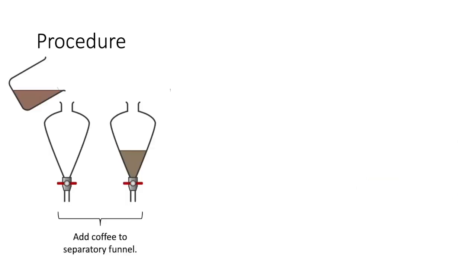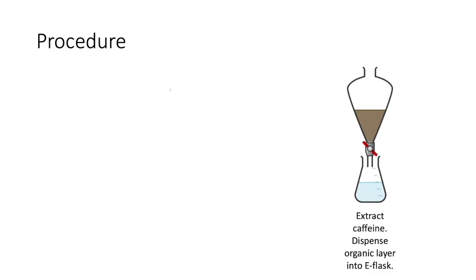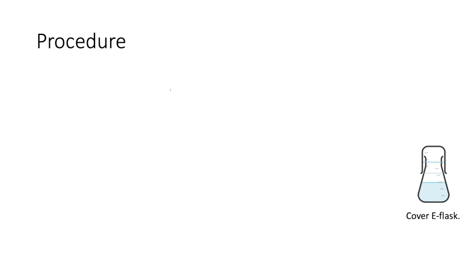At this point, you should transfer your coffee solution into a 250 milliliter separatory funnel. And then, at a fume hood, add a 15 milliliter portion of chloroform into the separatory funnel. Then you should extract the caffeine into the chloroform layer using either the instructions given in the lab manual or in the video related to using a separatory funnel. After doing your extraction, dispense the chloroform layer into a receiving container, in our case, a 125 milliliter Erlenmeyer flask. And once you've done so, be sure to cover your flask with a beaker.